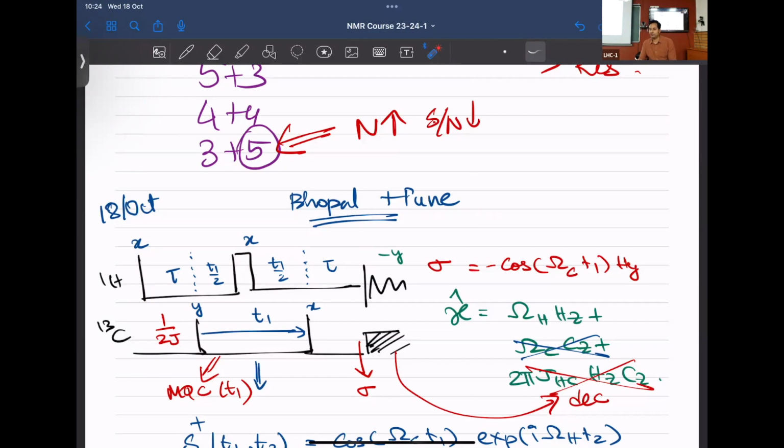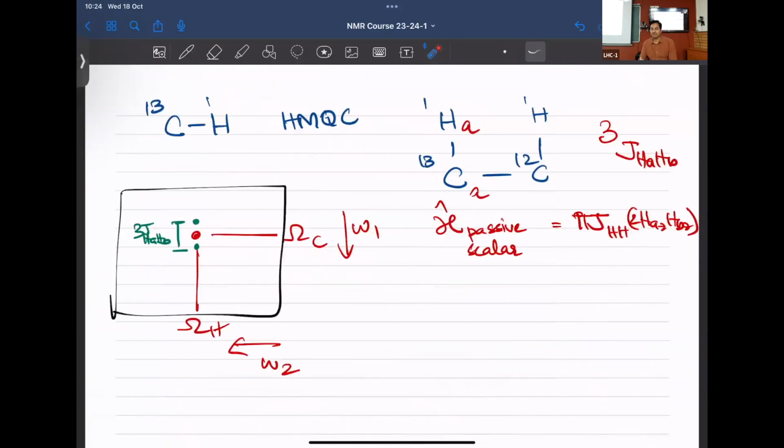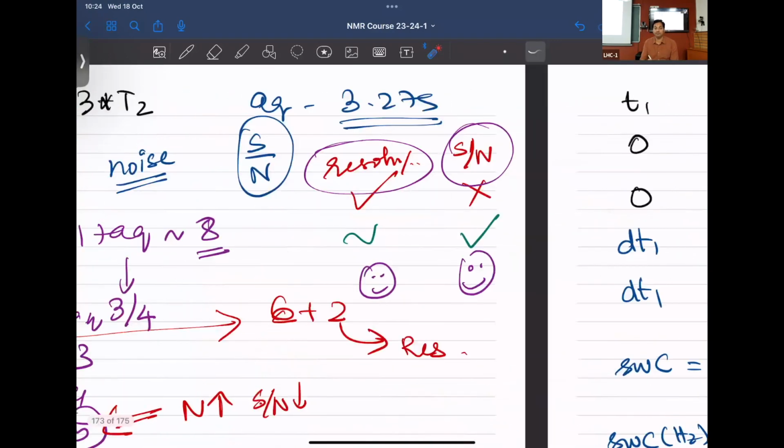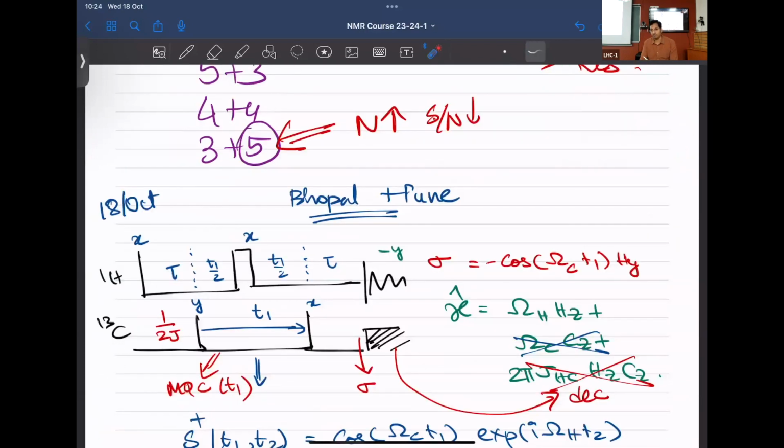Any other questions from others? The graph, the splitting you did on the carbon, split horizontally. Since it's happening in the T1 evolution, you'll see the splitting only in the T1. You'll also have some splitting in the omega 2 also, provided you have the resolution. In theory, you'll get 4. But remember, I'm talking about the evolution of this coupling only in T1 time. It will only affect the density matrix in the T1 time, not in the T2.